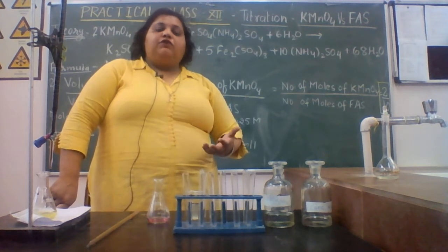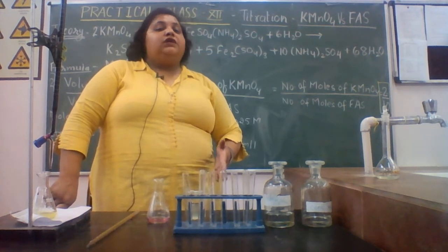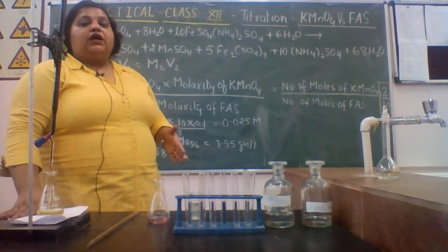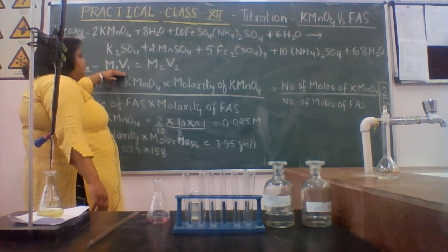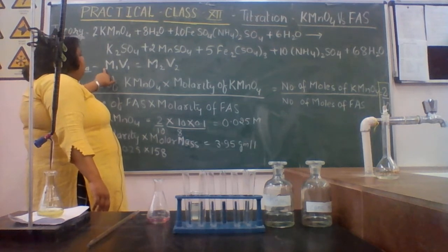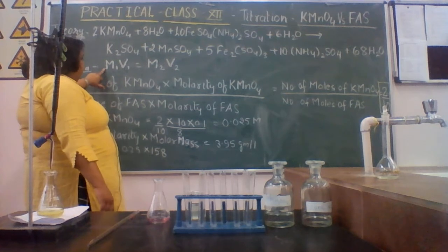Maybe the first reading will be dark, the second may be light. How long you have to continue the experiment? Till you get 3 consecutive similar readings, right. This formula works when both the stoichiometric coefficients are the same. Otherwise, here we need to use the stoichiometric coefficients, right.